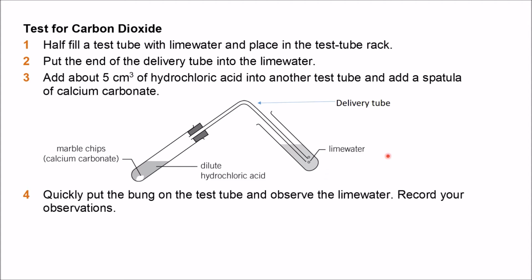So lime water turns cloudy in the presence of carbon dioxide and will tell you that there is carbon dioxide present. So you can actually breathe on lime water to turn it cloudy as well. If you breathe on lime water enough, it will turn cloudy, because we obviously breathe out carbon dioxide as well. Okay, so lime water is the test for carbon dioxide, and it will turn cloudy when carbon dioxide travels through it.